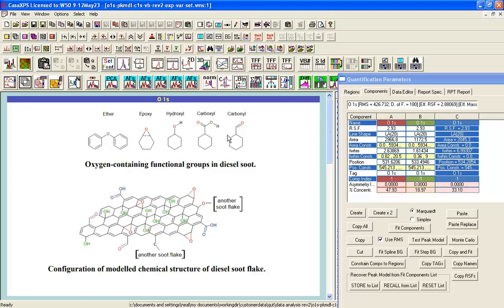We have five possible candidates for chemical state, and we need to decide whether we can get distinct peaks within the XPS spectrum. We have the ether and the epoxy — both representing oxygen single bonded to carbon — so we'd expect an overlap, counting that as one peak. Then hydroxyl (OH bonded to carbon) gives a second distinct peak. The carboxyl has a double bond, giving a third distinct peak, and then a carbonyl — also a double bond to oxygen. That gives three potentially distinct photoemission peaks.